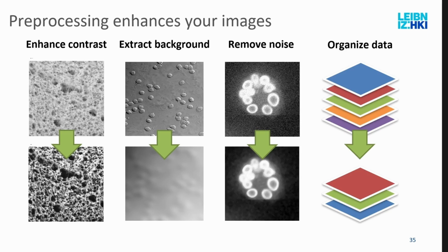Or the inverse operation, where when you have the background, you can of course remove it out of the image, just subtract it out, and this way you can get rid of this uneven background that will maybe disturb an algorithm down the line that expects an even background.